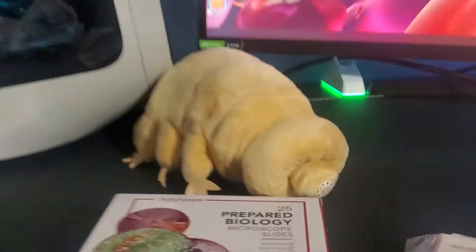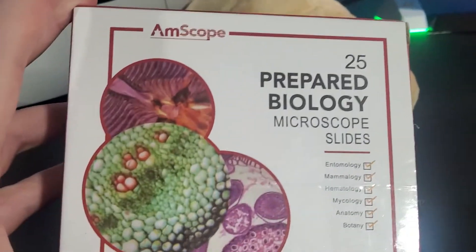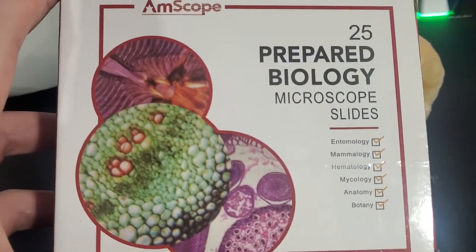I got a mossy sample — they like to live in moss — so this is some tree bark with moss on it. I went and captured this just now, so we're hoping to find a tardigrade on there. I'll be checking that later on another time.